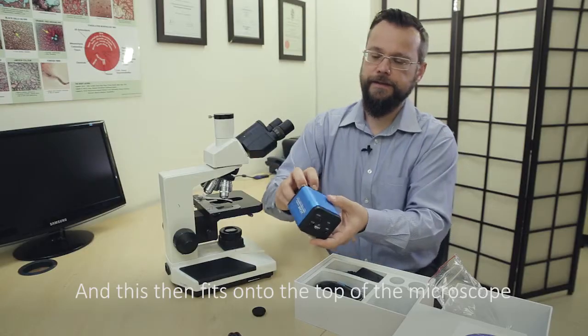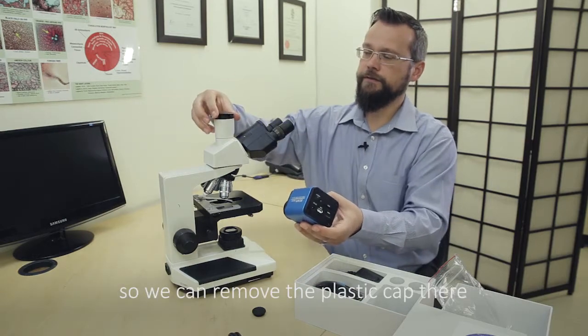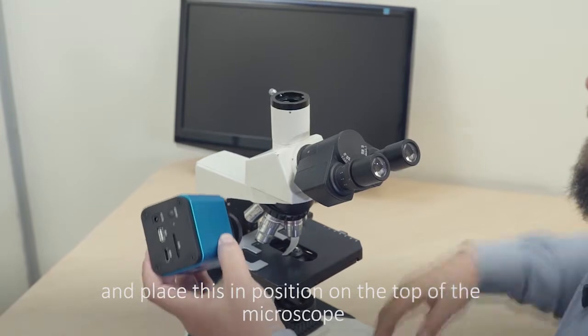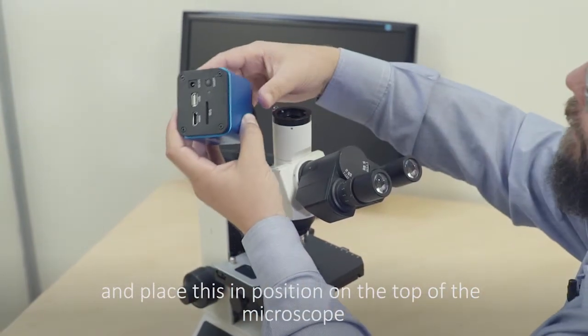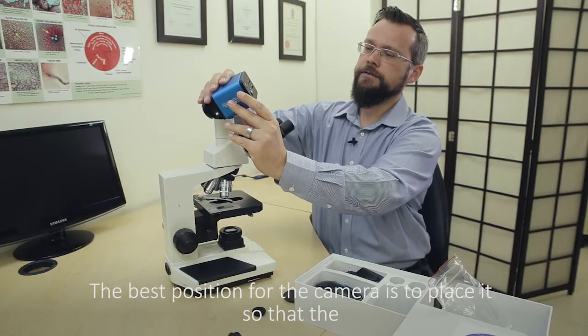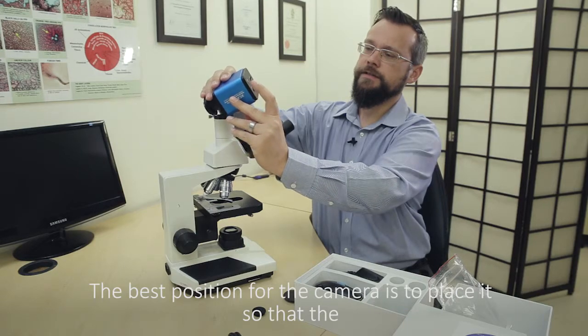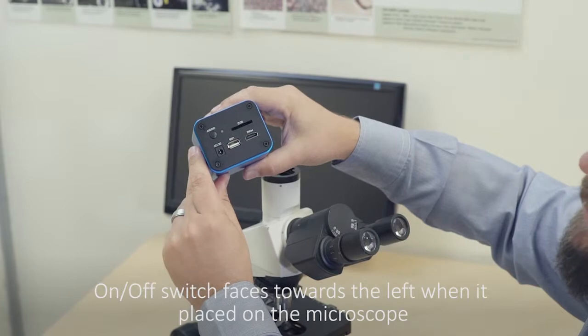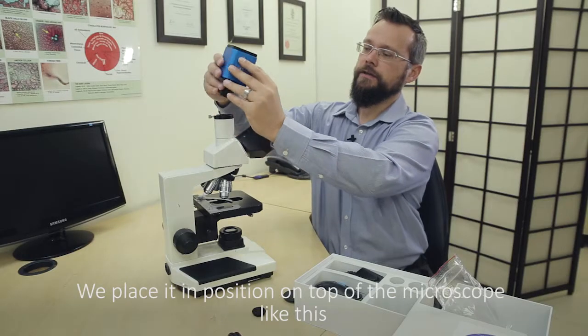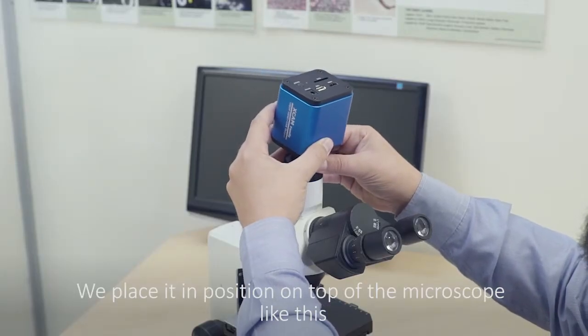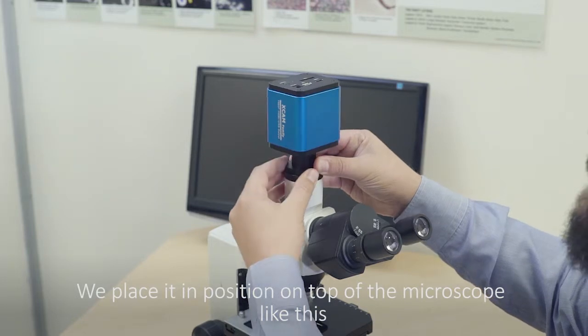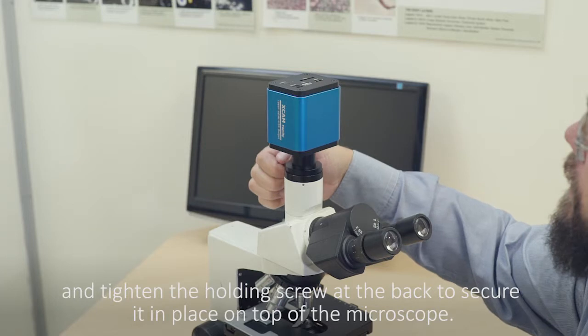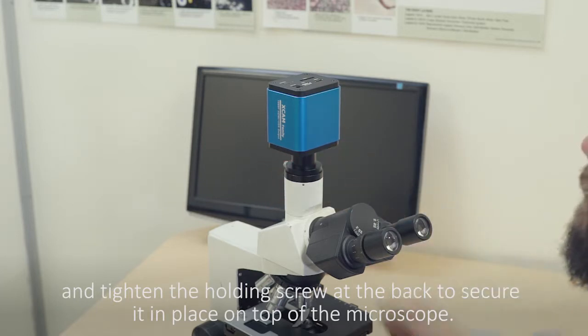And this then fits onto the top of the microscope. So we can remove the plastic cap there and place this in position on the top of the microscope. The best position for the camera is to place it so that the on-off switch faces towards the left when it's placed on the microscope. So we place it in position on top of the microscope like this and tighten the holding screw at the back to secure it in place on top of the microscope.